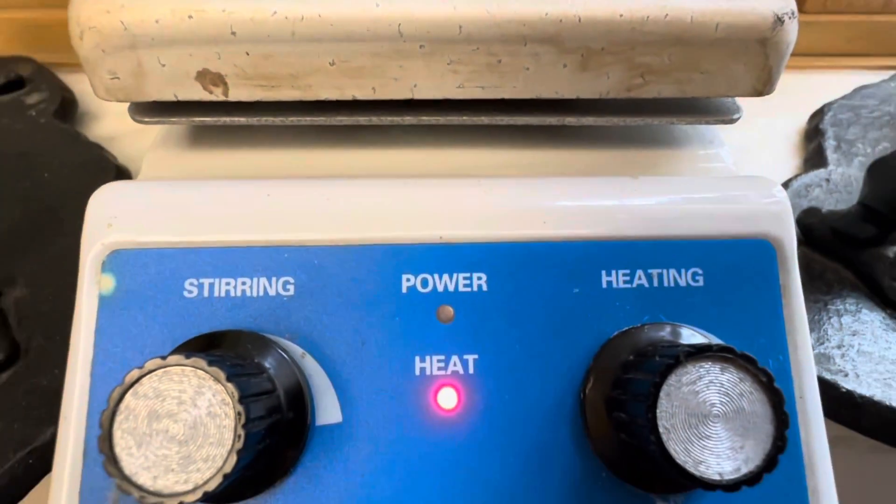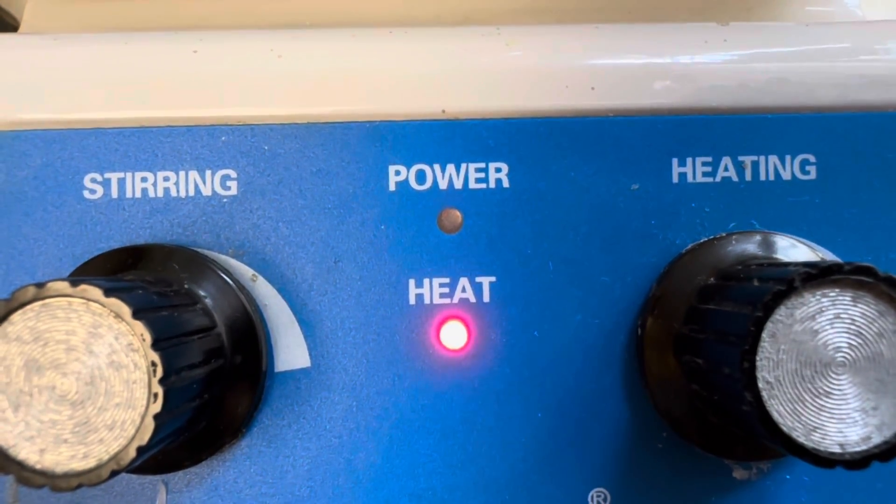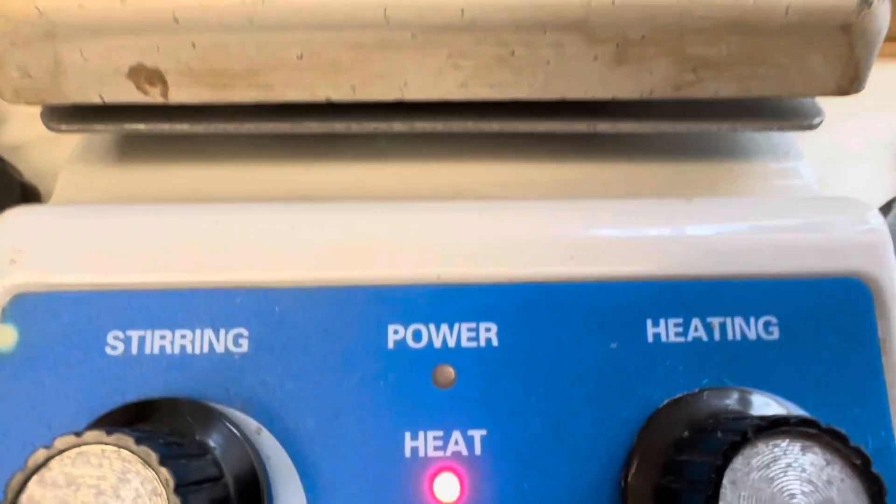Now if you notice that your reaction is slowing down, you can also use a little bit of heat to increase the rate of the reaction. I'm using my magnetic heat plate here just to increase the rate of that reaction.